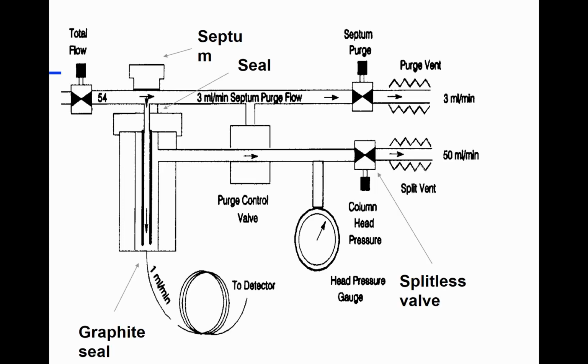And so I highlighted each of the places where things can go wrong, but getting the gas going the right direction. This is the area that's under high pressure. Once we get to the column, it's under almost no pressure. You're not going to get leaks on this end. To get the leaks here, we have pressure pushing on that column. So that's where you start looking through your system. That's where you do your maintenance of the system.